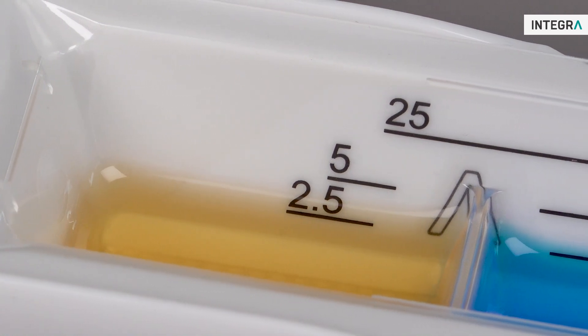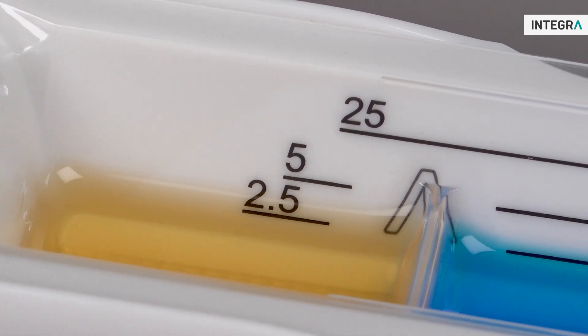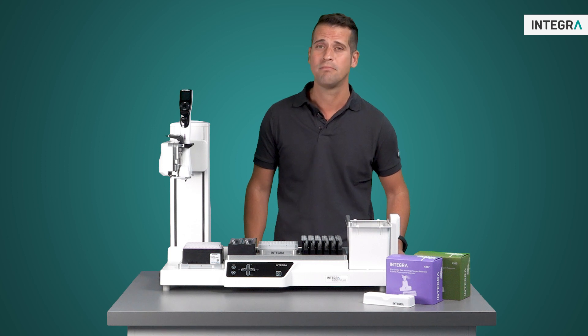Even in automation, Integra reservoirs help save time and money. Test it out yourself or check out our website for our application note.